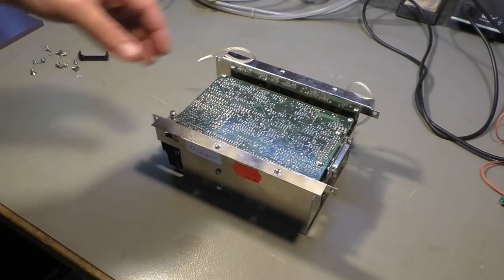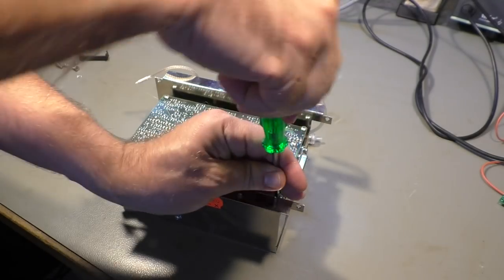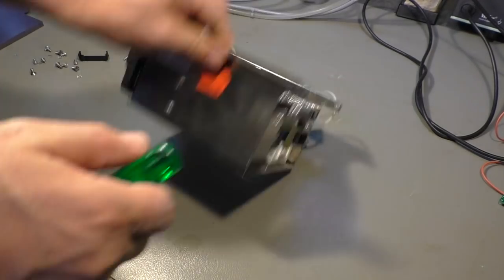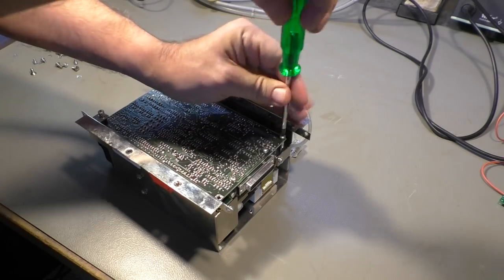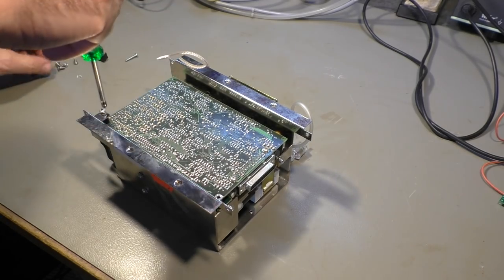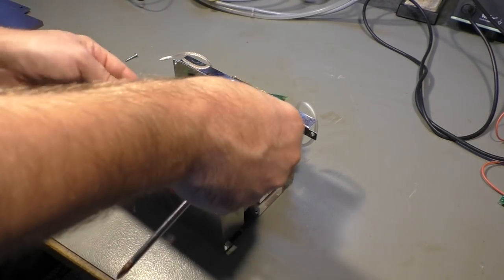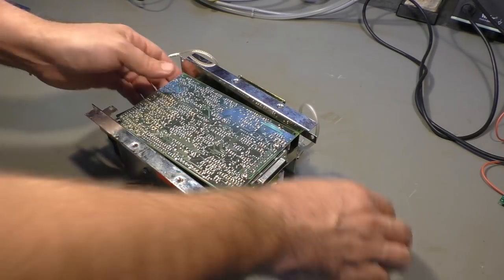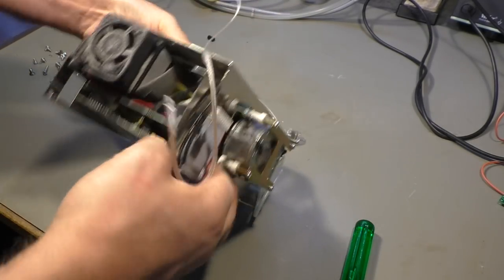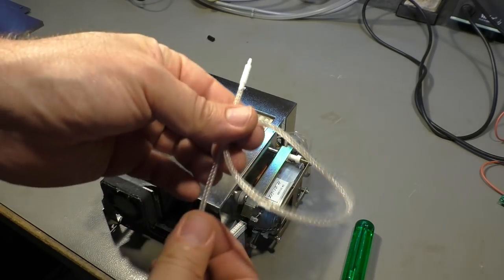Well, I don't think you wanna see the power supply, because you have seen a lot of power supplies, probably. So let's have a look at the heart of the entire thing. Not much to see yet, but that will be better in a moment. And we can already see one of the expensive parts here. And believe it or not, it's that hose here.